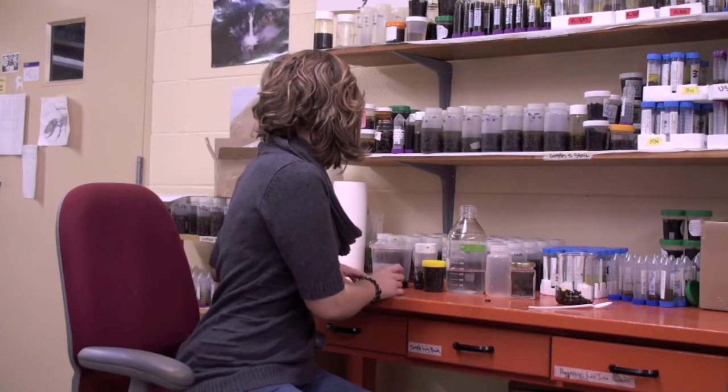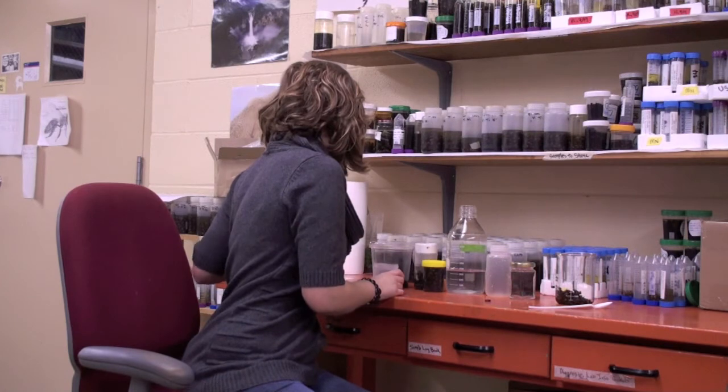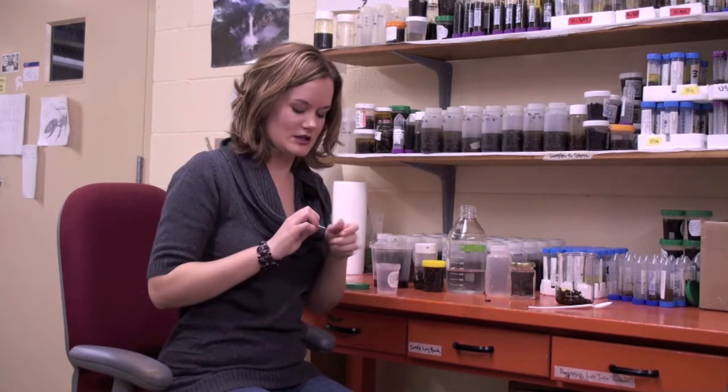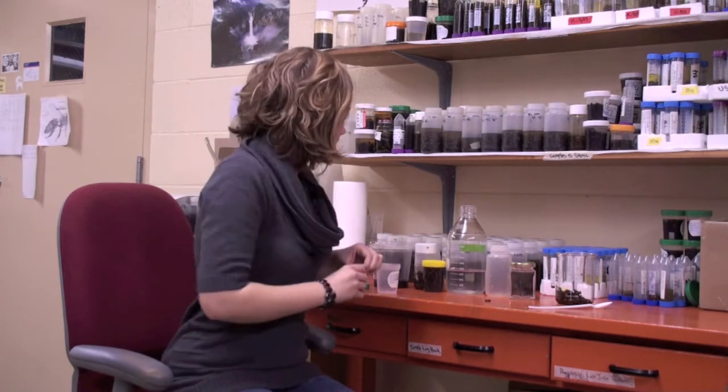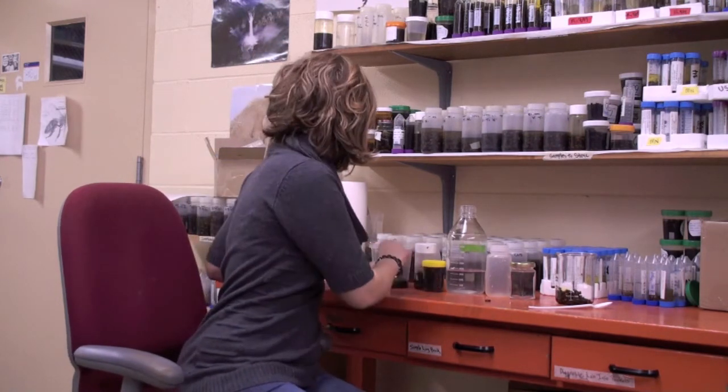And then what we'll do is take a little piece of paper and use a pencil and write your initials and the colony number on it. So that's all you need to do. You just need to get a little piece of paper. It doesn't have to be perfectly cut like this. You can just rip it off and write with pencil your initials and the colony number. And you'll stick it inside with the submerged alcohol. That way I have all the information I need when you send me your sample.